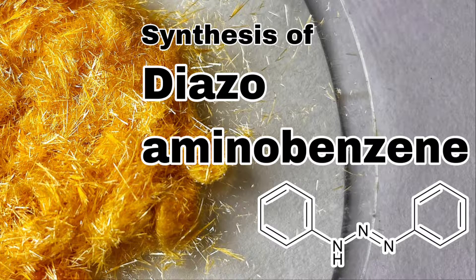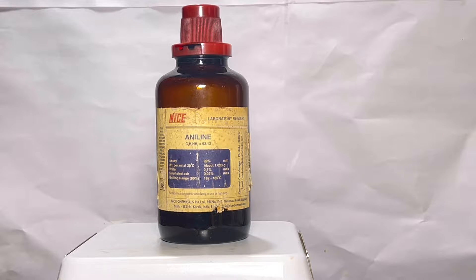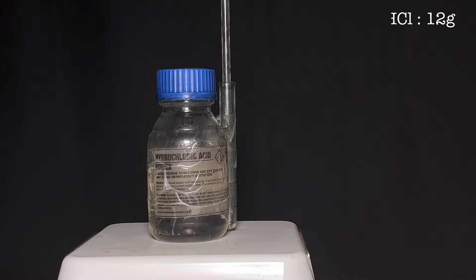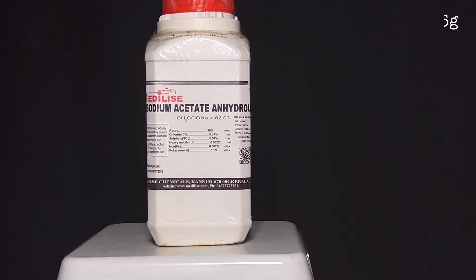Hello friends, in this video we will be synthesizing the compound diazoaminobenzene from aniline. For this experiment you will need 7 grams of aniline, 2.6 grams of sodium nitrite, 12 grams of concentrated 37% hydrochloric acid, and 10.5 grams of sodium acetate.